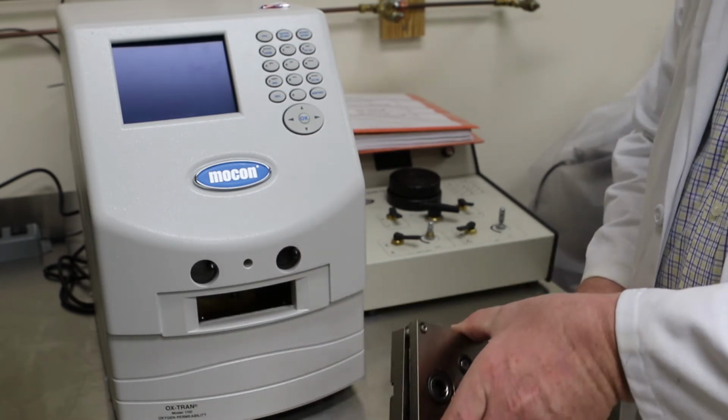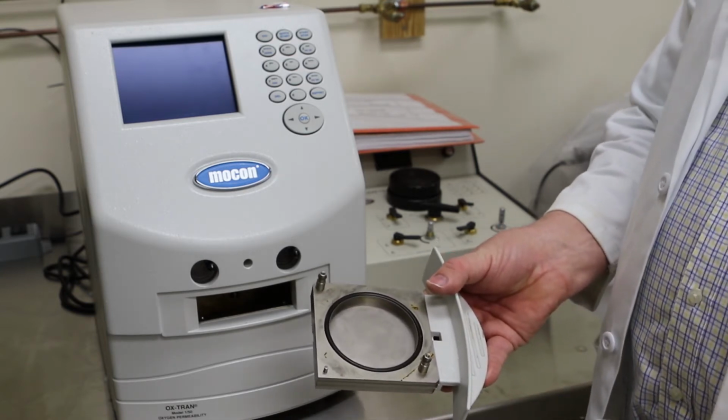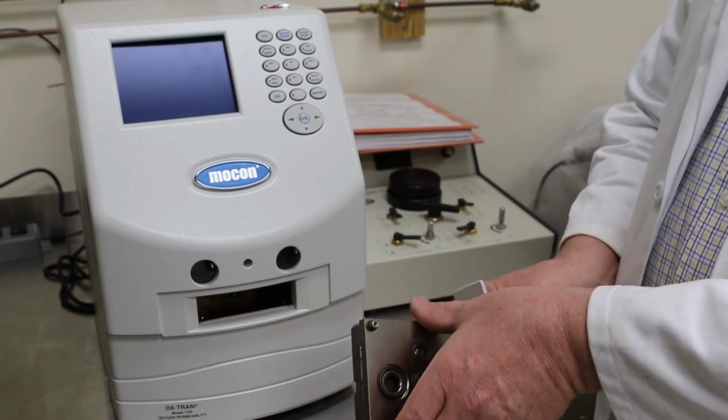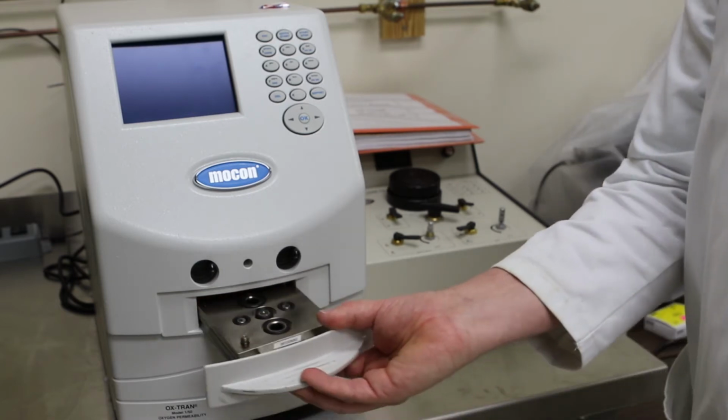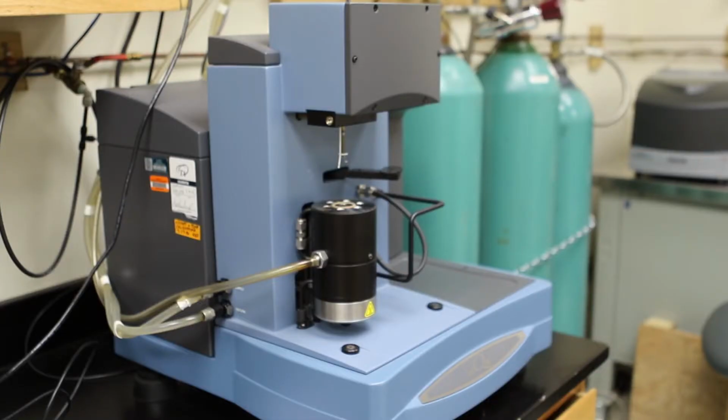not have this experience unless they were a master's degree student or even a PhD student in other laboratories at bigger schools. Frequently, my understanding is that they're not even allowed to touch some of these instruments until they're at those higher levels. So what we train them on is, one instrument is a thermogravimetric analyzer.